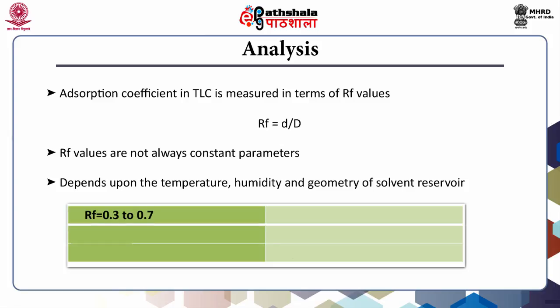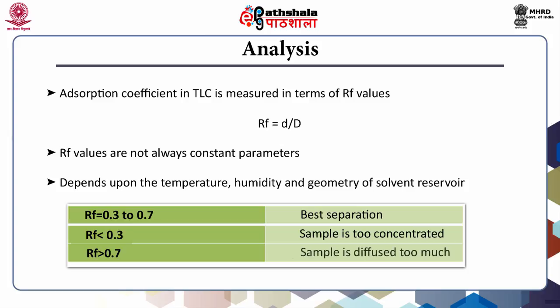If the Rf value is between 0.3 and 0.7, it gives the best separation. If the Rf value is less than 0.3, the sample is too concentrated and needs to be diluted. If the Rf value is more than 0.7, it means the sample has diffused too much.